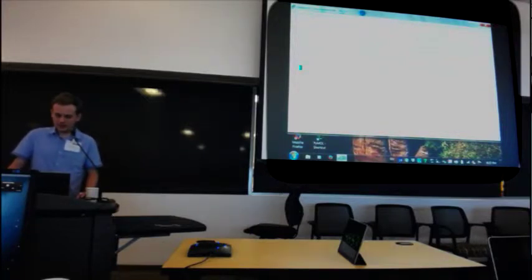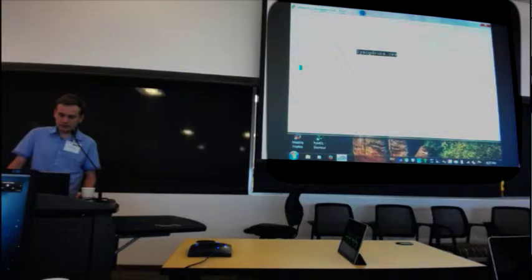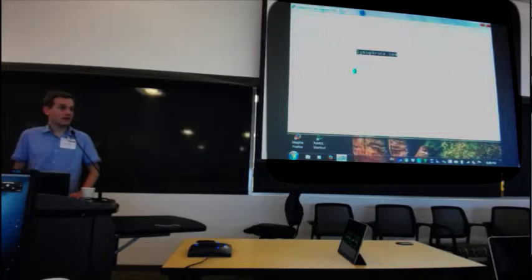So like I said, the file that controls both analysis steps with the CASS and the CrystFEL is this one, lysogd_run.csv. So we can have a look at what is inside this file. Is it too fast or too slow? Do you want us to run all of these commands in our directory?